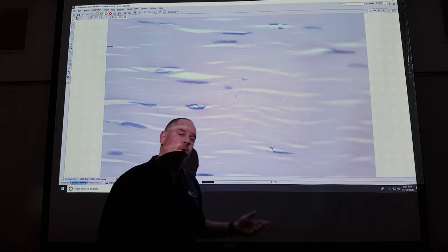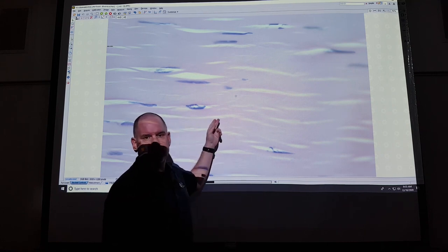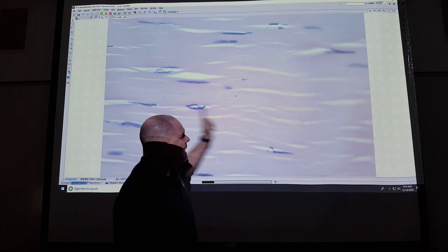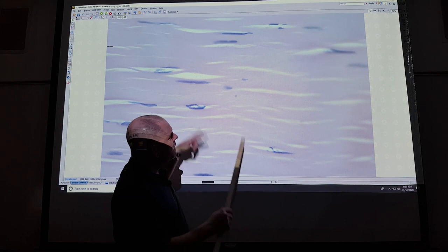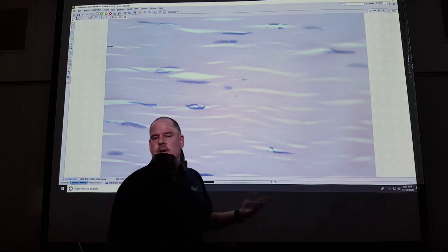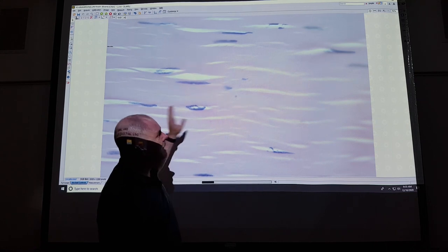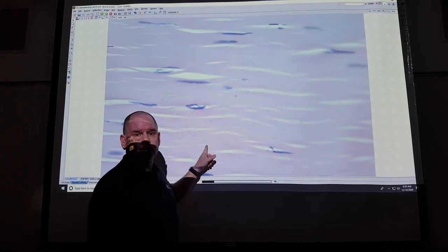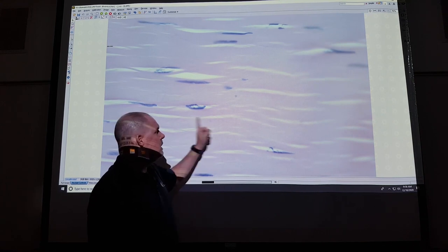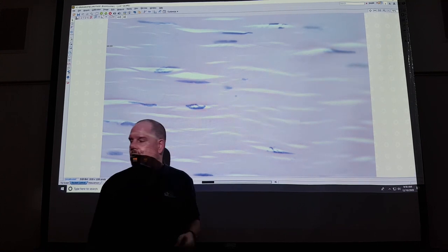Collagen fibers are often called white fibers because they're white before they've been stained. This is what a tendon or a ligament looks like with varying degrees of elastin fibers mixed in depending on which one you see. So, dense, regular connective tissue. Again, don't confuse it with skeletal muscle. They're not the same. This one has no striations or stripes in it. Let's take a look at a different view.